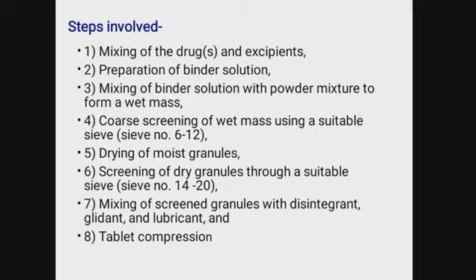Our third technique or third method is direct compression. In direct compression, the tablets are compressed directly from powder blends of the active ingredient and suitable excipients. No pre-treatment of the powder blends by wet or dry granulation procedures is necessary. Some granular chemicals like potassium chloride possess free-flowing as well as cohesive properties that enable them to be compressed directly in a tablet machine without the need for either wet or dry granulation.